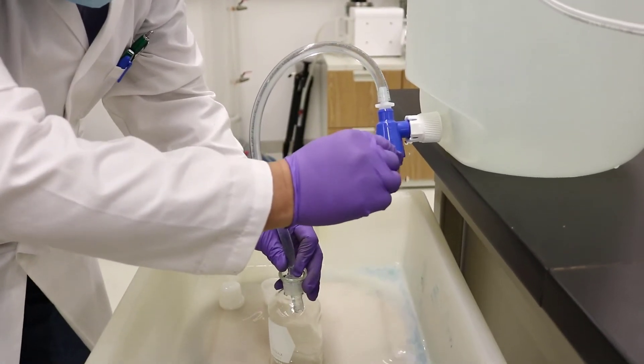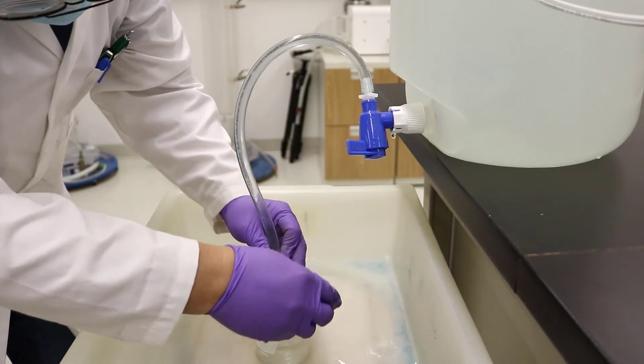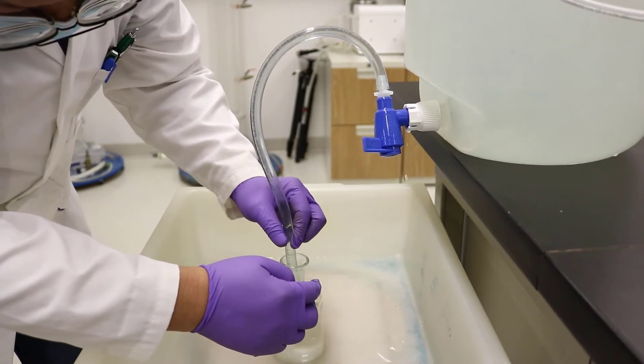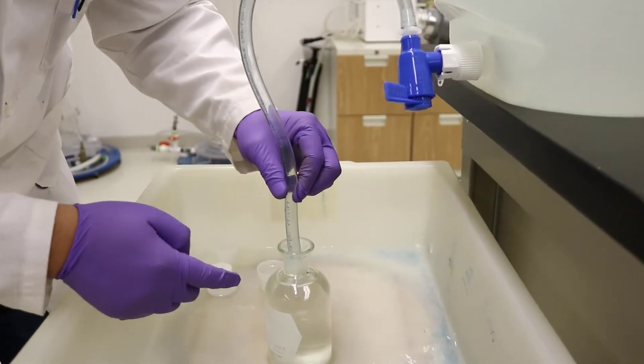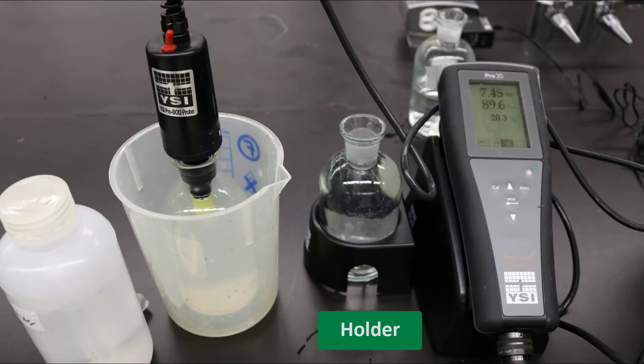In the previous section, we found DO by the titration method. Next, we will find DO by using a DO meter. Following is the operation procedure. Fill an air-saturated room temperature water into a BOD bottle. This should be done slowly and make sure there are no bubbles in the bottle. Once the water reaches the middle of the bottleneck, stop filling and put on a stopper. This is your room temperature sample. Put the bottle in the holder, which is attached with the DO meter.